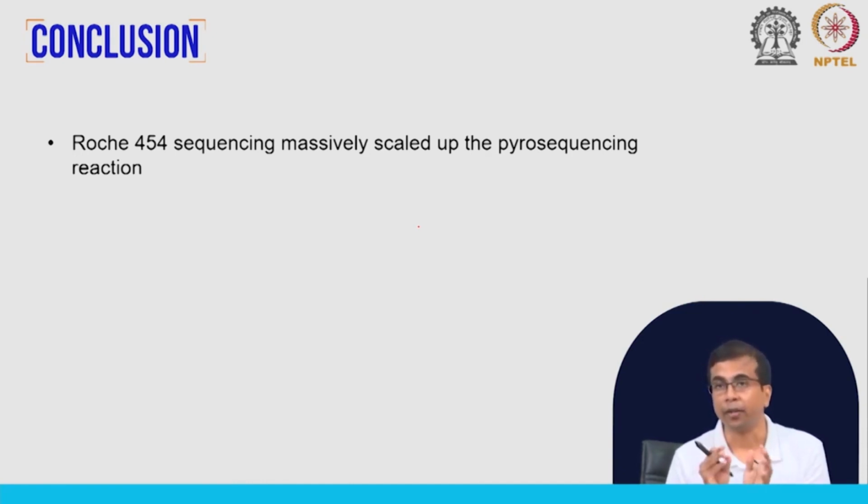It does not depend on the base itself; you end up with a light signal whichever the base is. This light signal can be detected, and it indicates there is an addition of a base to the growing complementary strand. This light signal then acts as the detection across these wells. If you can visualize in your mind, across the picotiter plate the detector is seeing these signals of light as the sequencing reaction goes on, across these 100,000 wells. And from that it is doing the base calls.